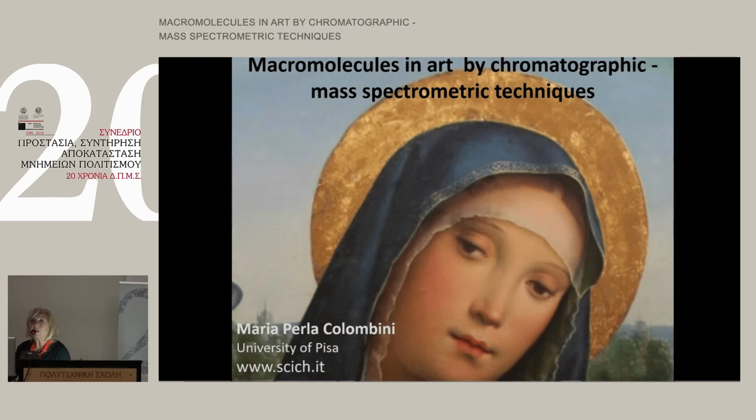Well, I shall speak about the organic material that I am able to find in archaeological findings and in paintings. Particularly, I have prepared some examples of how mass spectrometric techniques, mainly interfaced with chromatographic techniques, can help us to understand the composition of the material which artists used in the past or in contemporary art.